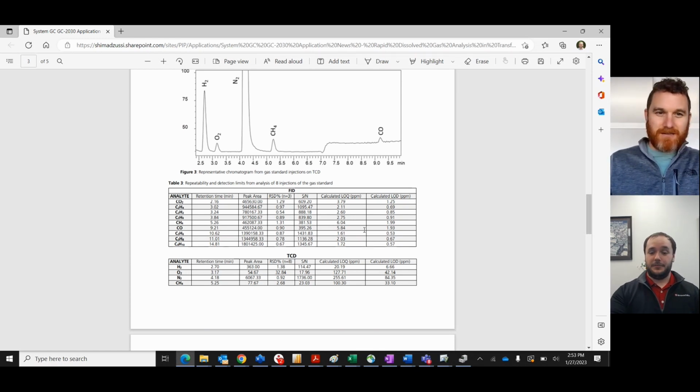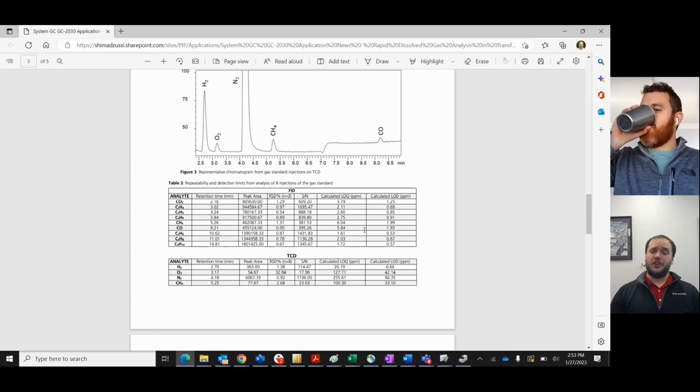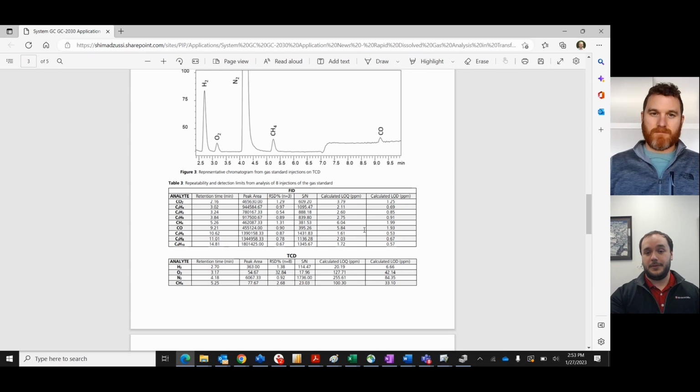Thank you. The other thing I did want to mention, since we're talking about these new oils and the various oil types, is that we want to keep in mind future-proofing this system. These new FAME-based oils are becoming much more important to the industry. One, they're renewable and a lot more environmentally friendly. If something catastrophic does happen, microbes can break down FAMEs, but they can't necessarily break down mineral oil or silicone, as some of the other oil types are.